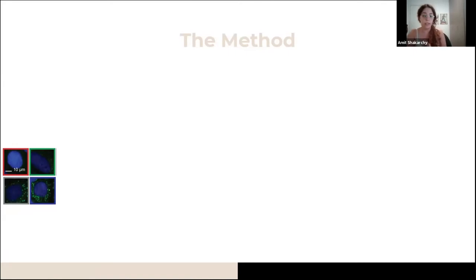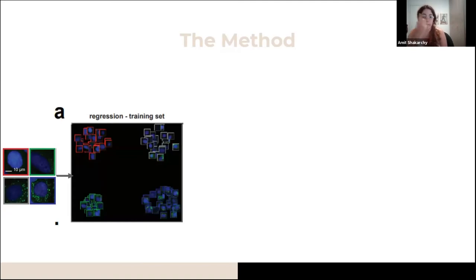The first one is scoping out single cell images out of the time-lapse data. And then the expert has to use some specialized tools, such as CellProfiler, to do feature extraction, segmentation, even illumination correction, etc. Then the expert prepares the annotations for the training set samples by positioning the samples on the regression plane. So for every training sample, the expert assigns coordinates that correspond to the position of the sample in the biological process, instead of determining a single steady state.